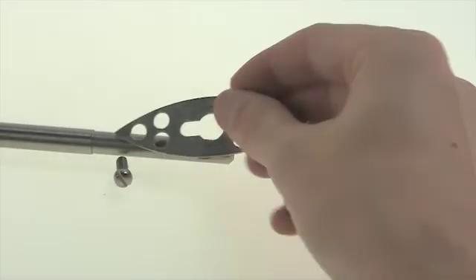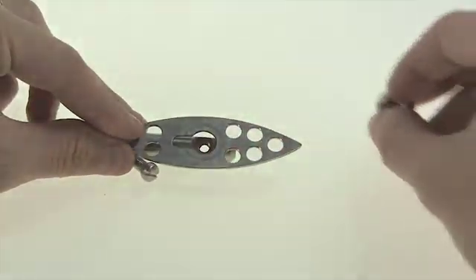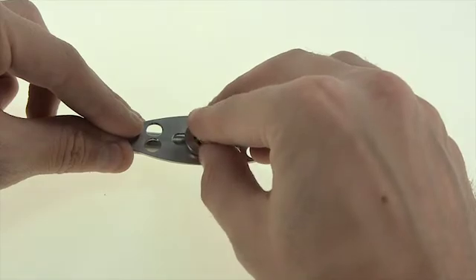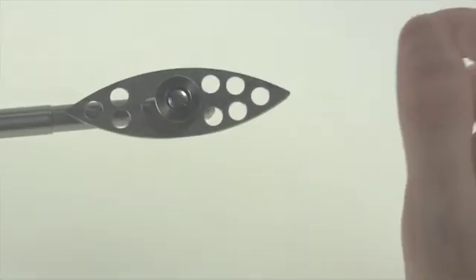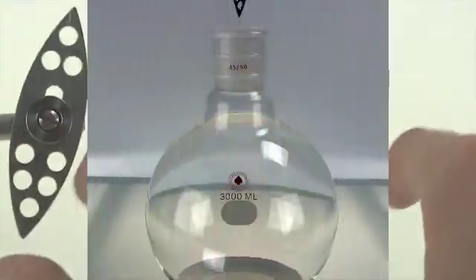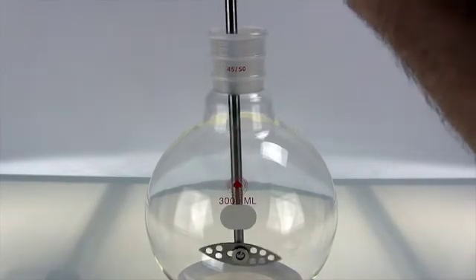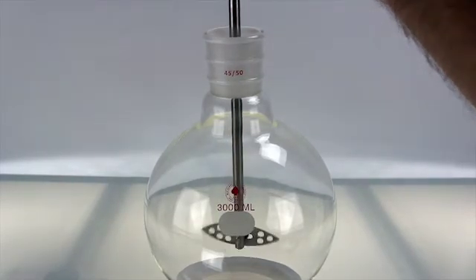First place the agitator's hole over the stir shaft's hole. Then insert the button into the hole. Finally, insert the screw and fasten it together. You will notice that the agitator still has room to spin. When you insert it into the flask, make sure to have the agitator vertical. As the stir shaft spins, the agitator will naturally become horizontal.